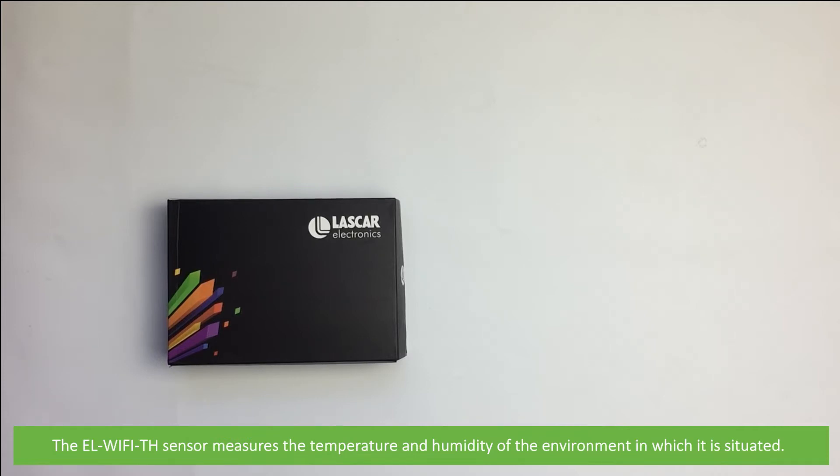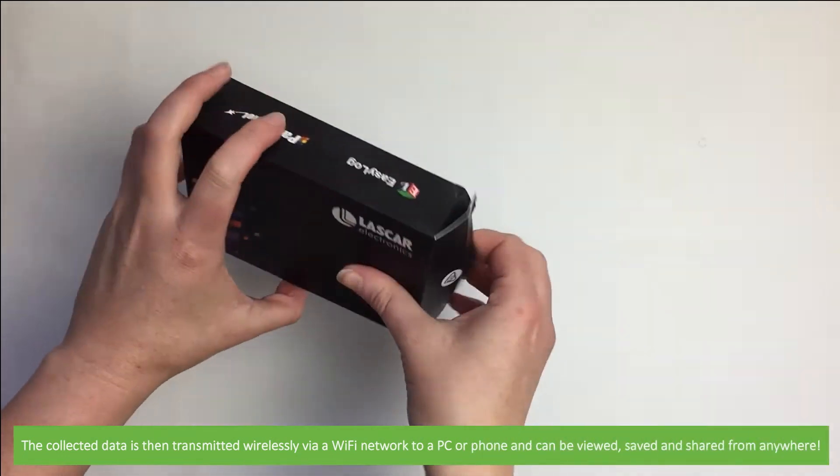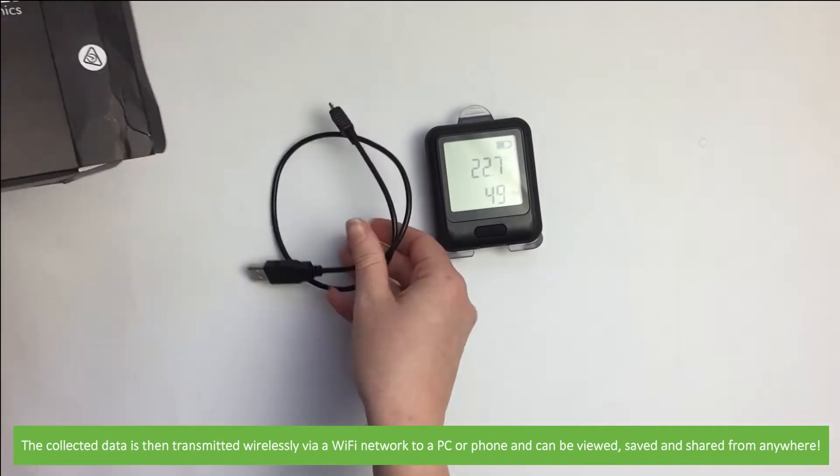The EL Wi-Fi TH sensor measures the temperature and humidity of the environment in which it is situated. The collected data is then transmitted wirelessly via a Wi-Fi network to a PC or phone, and can be viewed, saved and shared from anywhere.